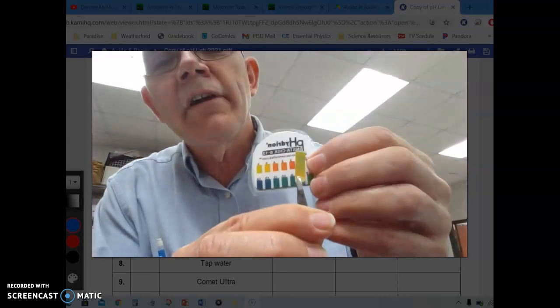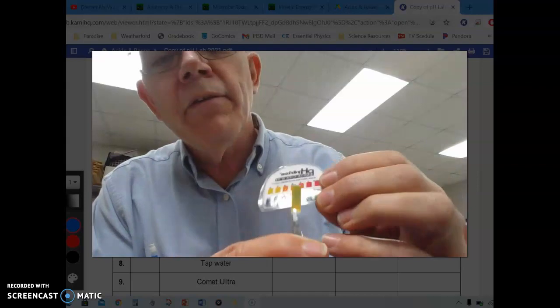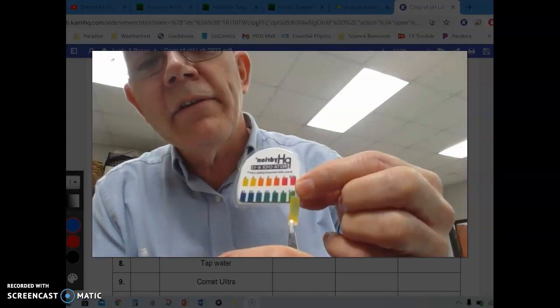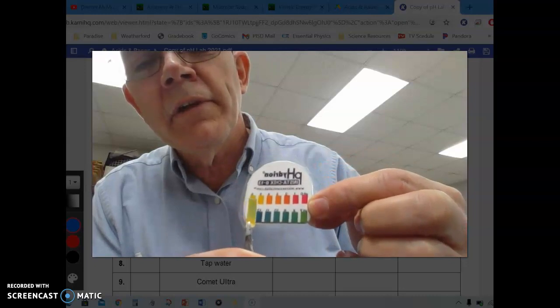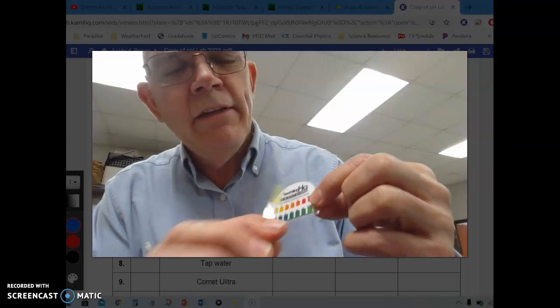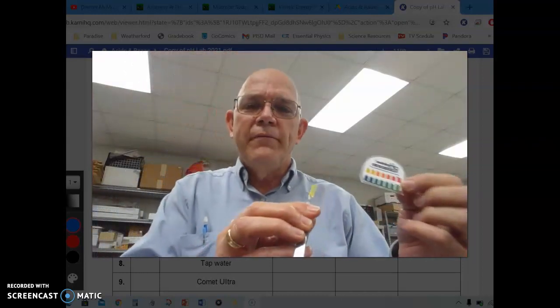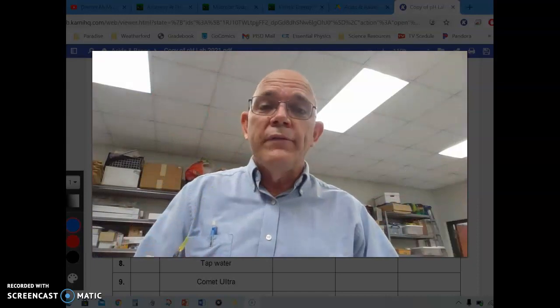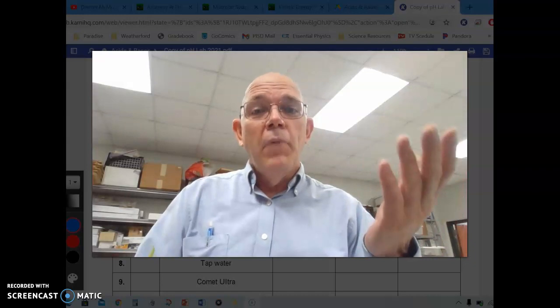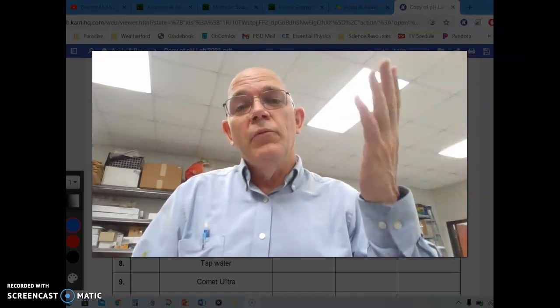If we put it against our chart here, it's got a little bit of green color like that does, but it also has a little bit of the color at 6. So I would say it's between 6 and 7. It has a little bit of green in it, so we're going to say 6.5. Now, theoretically, pure water should be exactly neutral. But we don't know if this is 100% pure water, so we'll go with what we got.